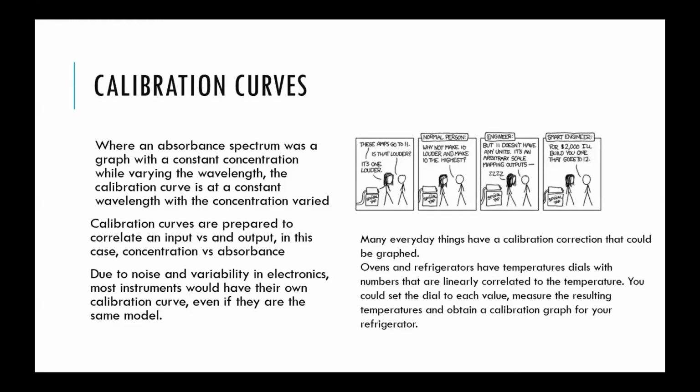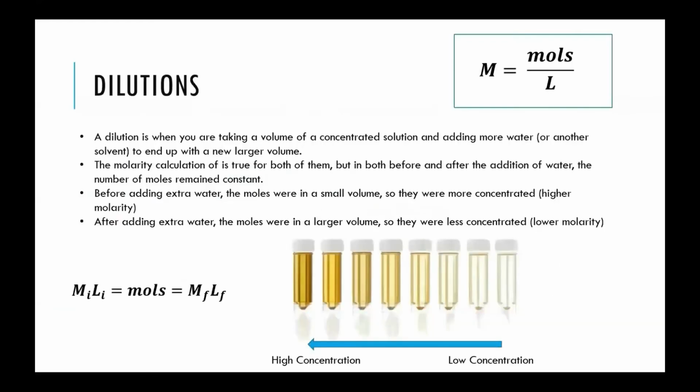So in something like preparing a calibration curve, many times in chemistry or in a lab, you're preparing a calibration curve using concentration. You have a higher concentration to start with, and you are making various dilutions to that concentration. And then when you have that series, a whole series of different solutions at different concentrations, you can then measure a property based on the concentration. In a lab like this, it's measuring the absorbance based on the concentration.